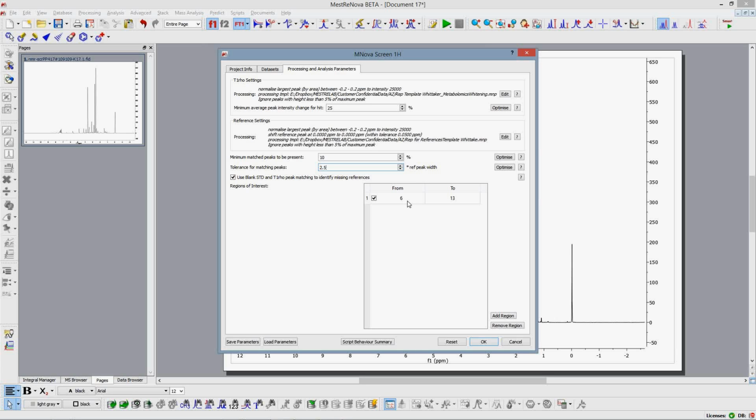If you don't do that, any signal that is around that region is going to be heavily distorted, and it's just going to give you a bit of a headache. In the same manner, for this particular set, there was a lot of bumpiness around the region of 2.5 to 4 ppm. So pretty much there were no signals left in the aliphatic region, and we just focus on the region corresponding to aromatics and exchangeables.